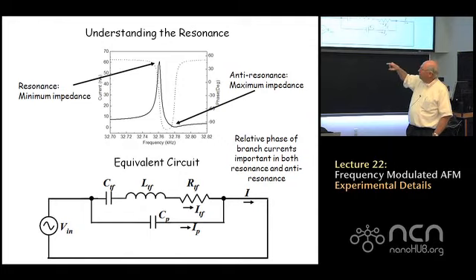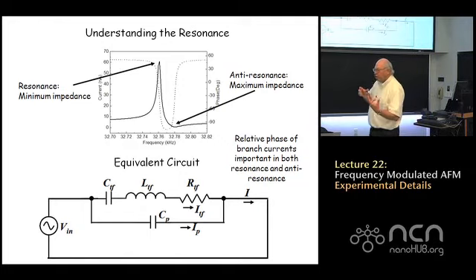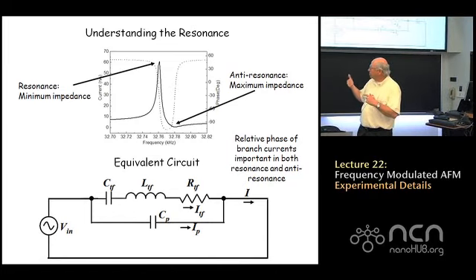And this anti-resonance, this shallow dip in the resonance curve at frequencies greater than the resonance frequency, that occurs when the tuning fork has its maximum impedance, right? And the reason tuning fork can have a minimum and a maximum impedance is because the circuit model for the tuning fork involves 2 parallel branches, as I've indicated schematically in this picture.